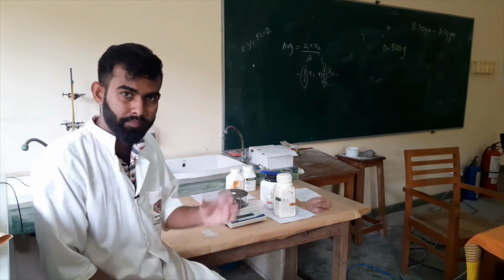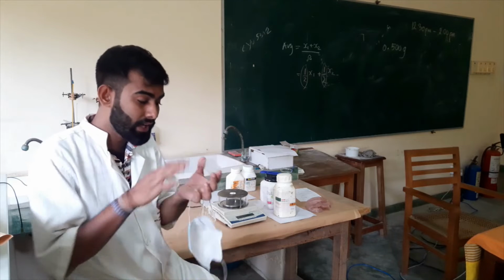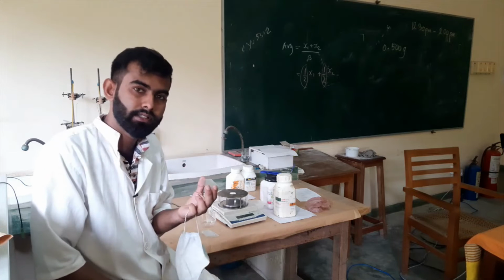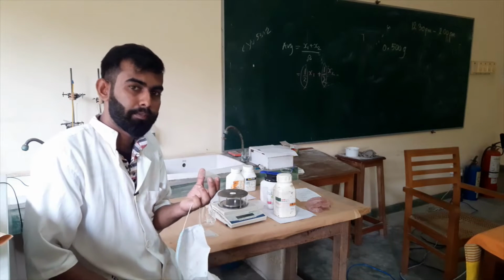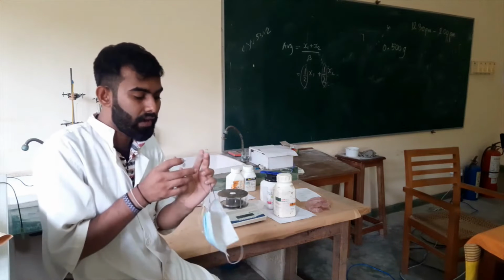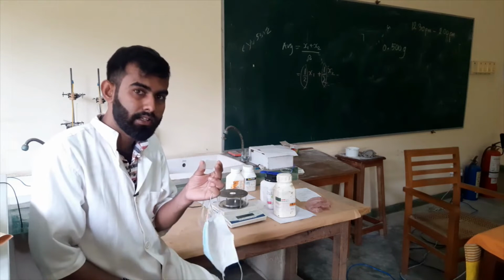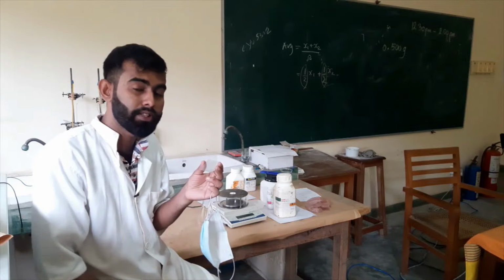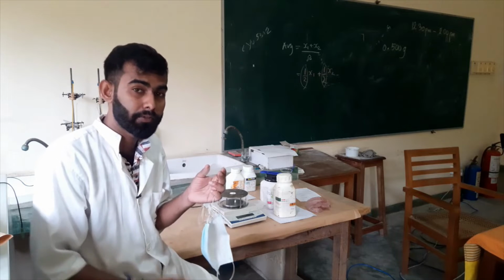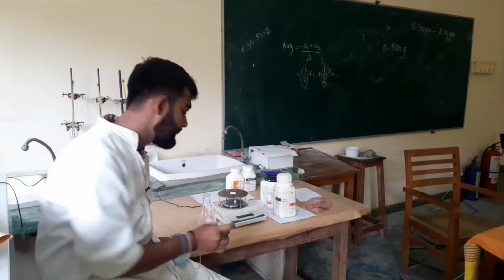TLC plate means, here you have a glass plate. On this glass slide I will spread silica gel paste, spreading it evenly on the glass plate, then I will dry it out, and after that it is called a TLC plate. This TLC plate is used in organic chemistry separation methods for chemicals. However, the preparation of a TLC plate is an interesting thing.